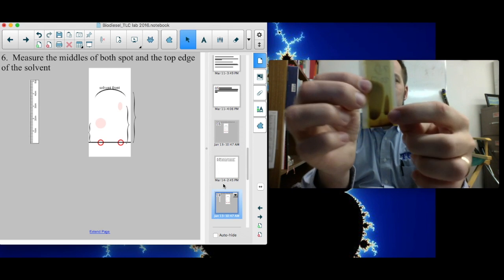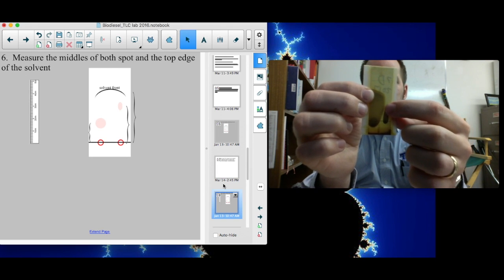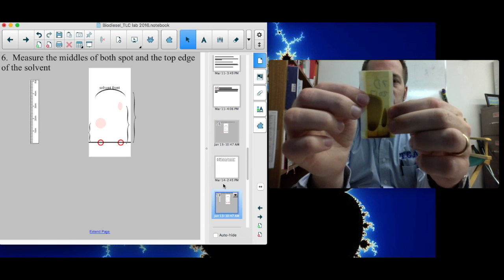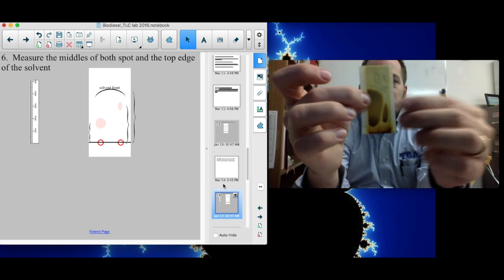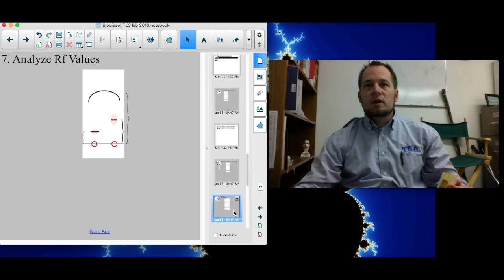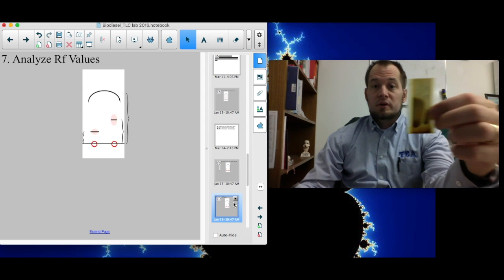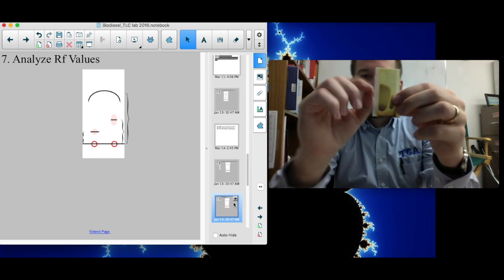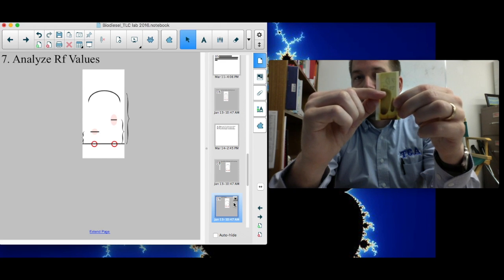And then on this side, you got the oil, which did not move as much. It basically stayed at the bottom and kind of went maybe half as much. So even just without doing any measurements, we can see relatively we made some diesel versus starting with the oil. So that's good news. We actually did get a chemical reaction that we would like. Now, we can take this then and analyze the RF values as well. So we would start with the starting line down here and measure up to the middle of one of the spots. You don't measure to the very top, you measure to the middle of the spot.